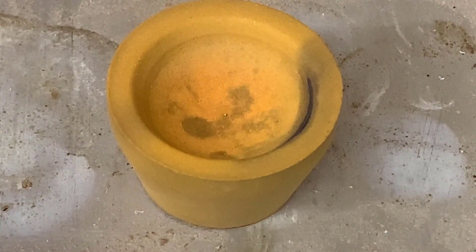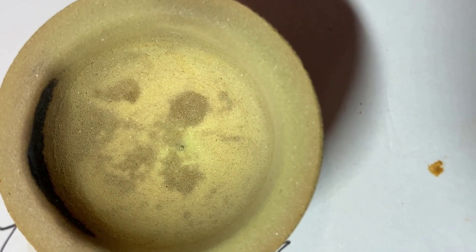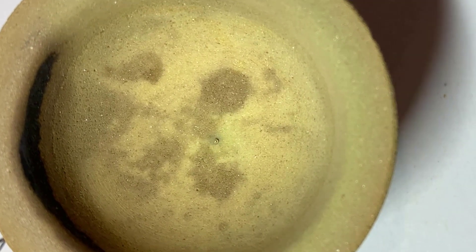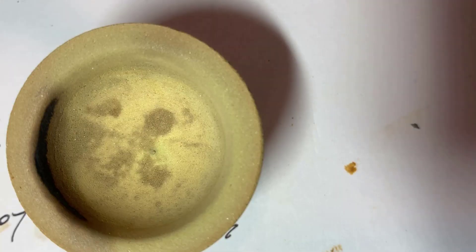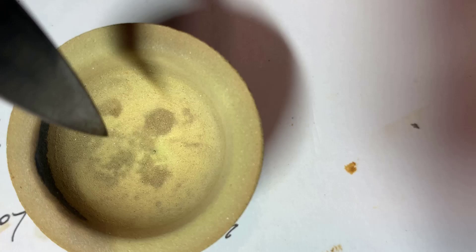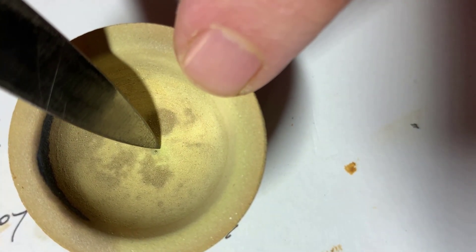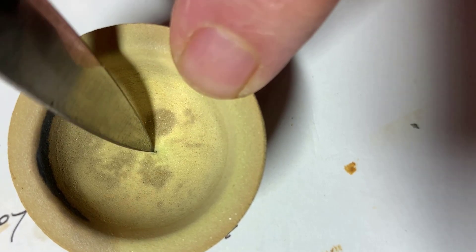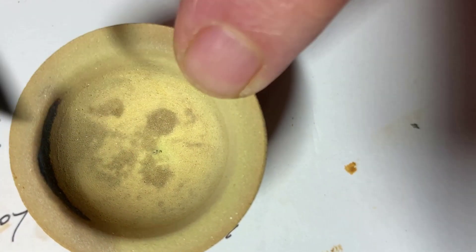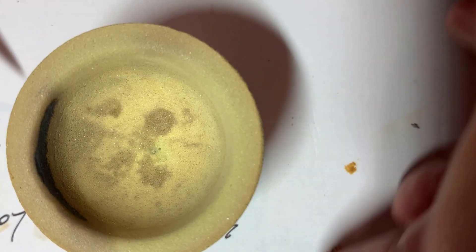Quite a bit of work to get a little tiny bead. I started out thinking I wouldn't get anything, so that's human nature for you. Anyway, I've got to get it out of there to weigh it. I've learned not to try to pull it out with a pair of tweezers because it's stuck — you've got to first dig it out or you'll have a good chance of losing it. Out of here and on to here.